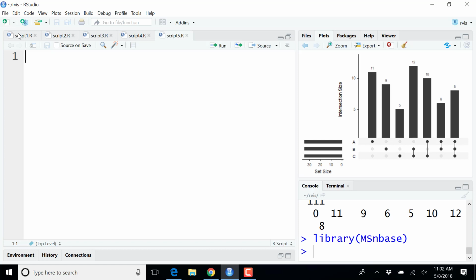Each point here, or sample, for example 1, 2, 3, 4, 5, has been characterized by measuring the expression of 2 proteins, X and Y. So if we do a scatter plot of X, Y, the intensities, sample 1 in X, sample 1 in Y, and so on, we get this scatter plot. And then we would like to do some hierarchical clustering on this data.